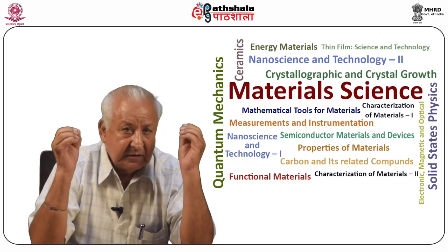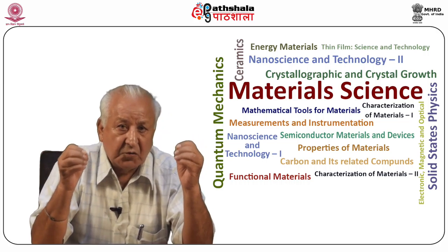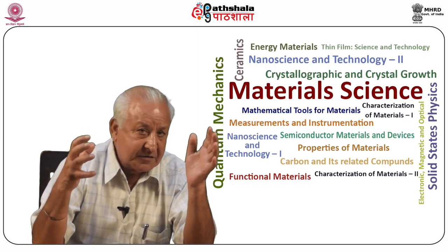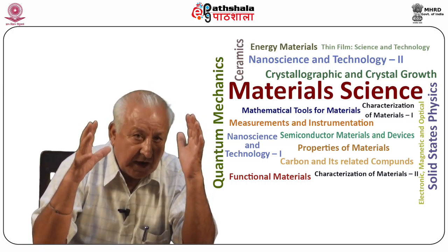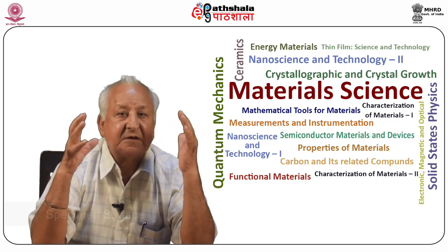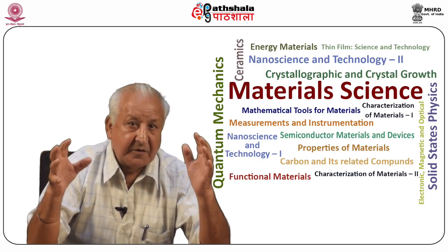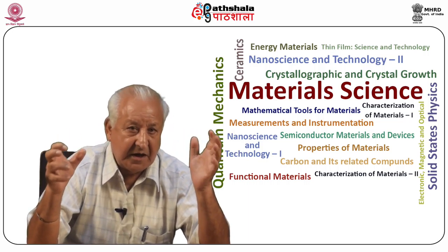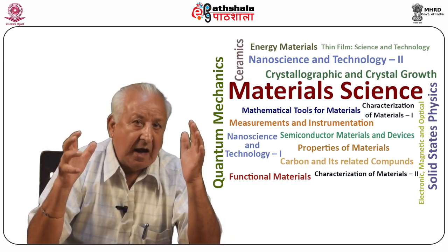However, in the SEM, the lens is designed so as to focus the incident beam of electrons to a fine spot around 100 to 300 angstrom diameter, which then interacts with the specimen. The fine spot is dynamically scanned across a square area of the specimen surface. The interaction leads to scattering of electrons from the surface. The scattered electrons are received by the Faraday cage, which appears in the form of a signal. The signal is amplified.